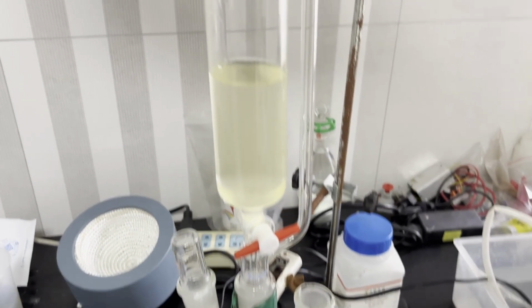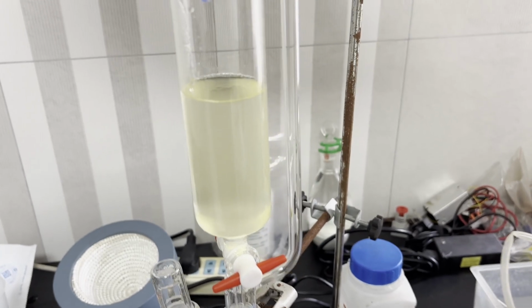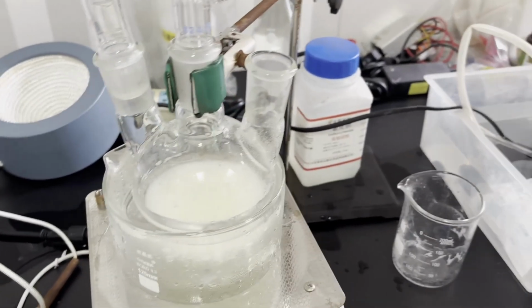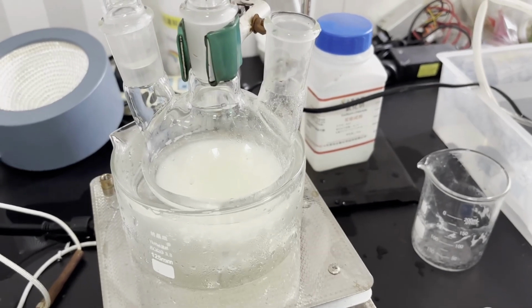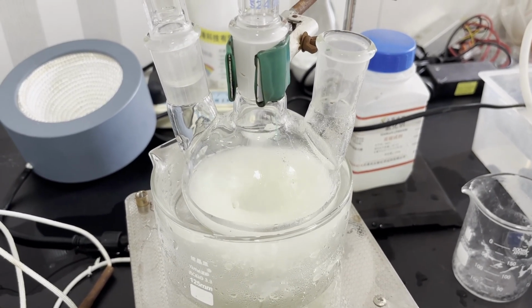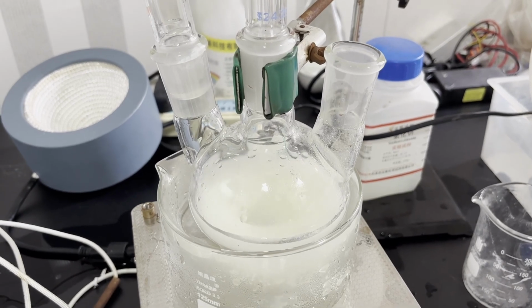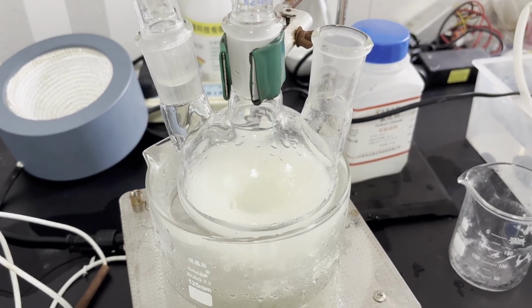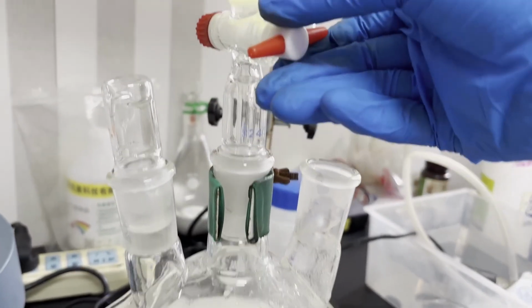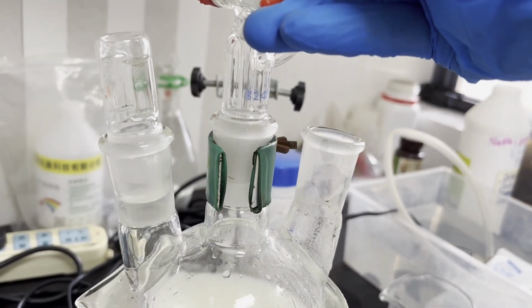This final section of the video will address how the procedure can be improved for mass production of potassium azide and potassium metal, so feel free to skip it if you want. First, the 60% yield looks bad at first glance, but the hydrazine hydrate preparation step probably has a bad yield since I didn't completely powder the potassium hydroxide and didn't wash the potassium sulfate many times. If I buy 80% hydrazine hydrate instead, the yield should be much higher and closer to 90%.